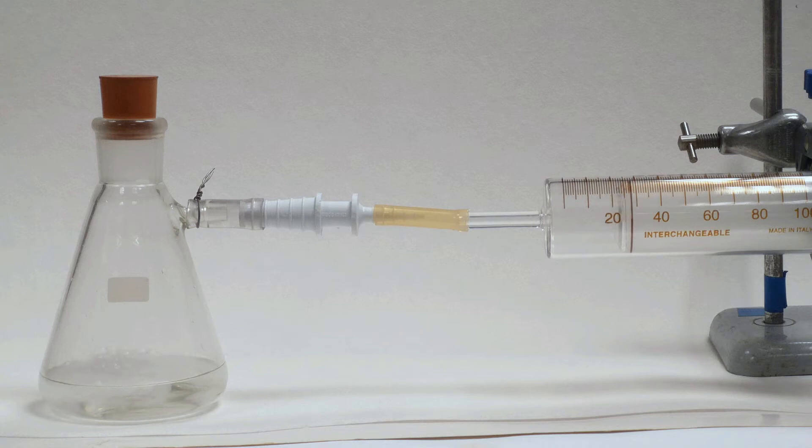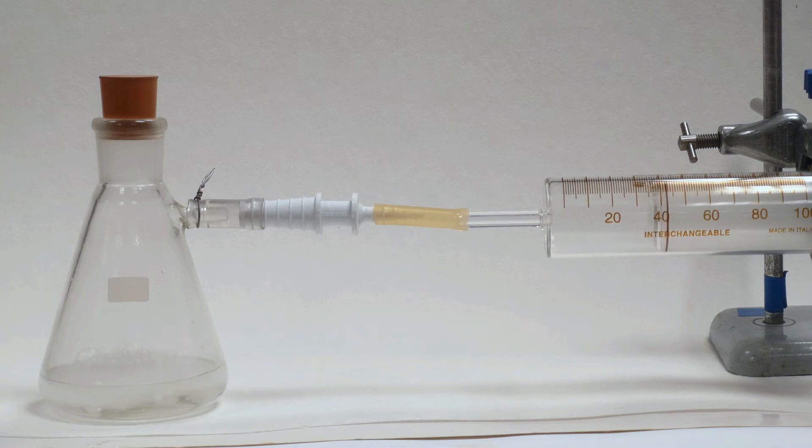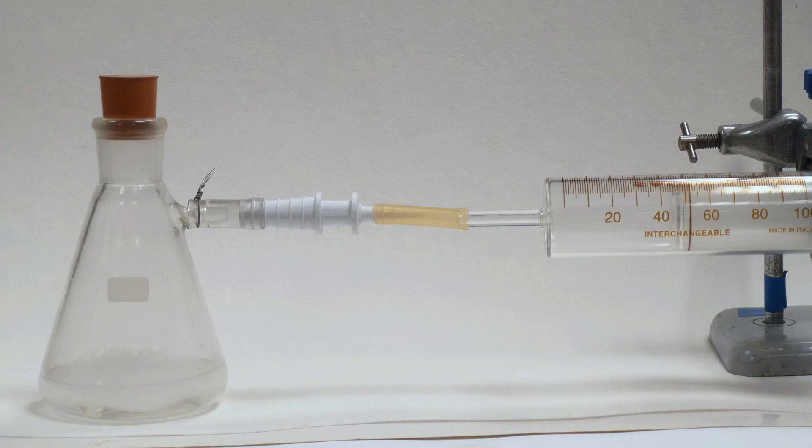Repeating the experiment with 1 molar acid shows, not surprisingly, that the rate of gas production is slower. This time it takes nearly 30 seconds to produce 80 cubic centimetres of hydrogen.